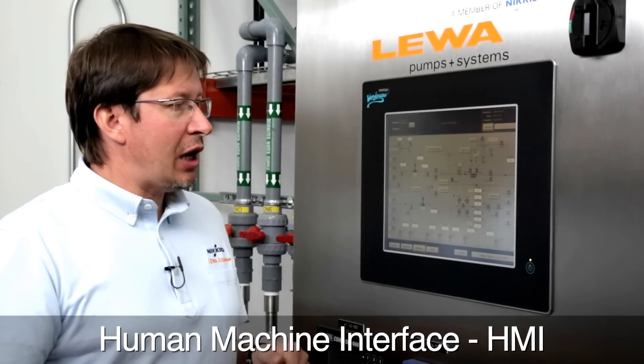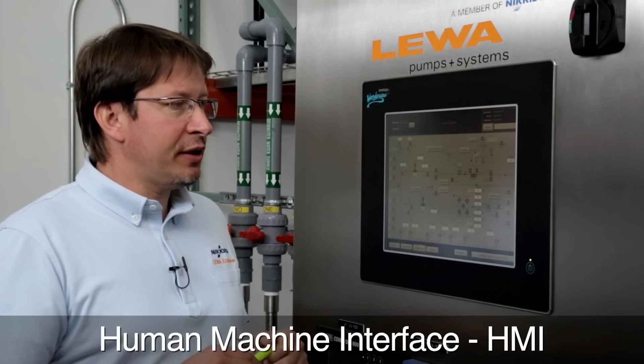The system is made from two main components. First, the human-machine interface, which allows the operator to control the system — for example, to make inputs or to control the pumps.